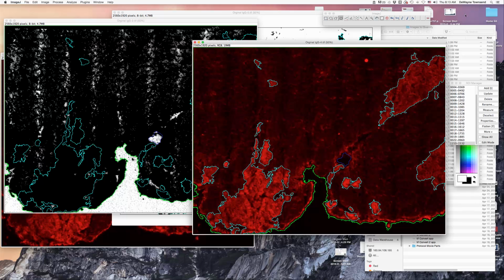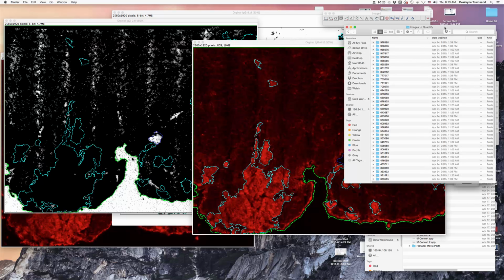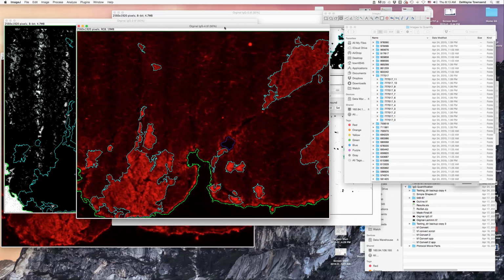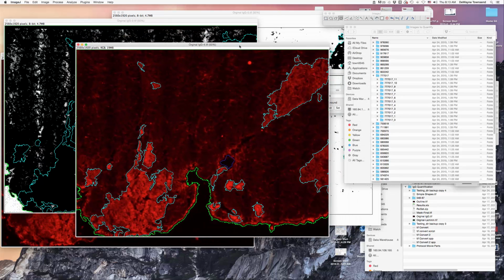On the server where these images are stored, every mouse has been given a specific identification table, and then every image from that mouse has its own little directory. And as you start, each directory has a single TIFF file sitting in it, which would be the equivalent of this original image. Now we've gone through all this effort to identify these particular regions of interest, so we want to be sure that that work is able to be saved and accessed at a later date. So there's several things that we have to do.